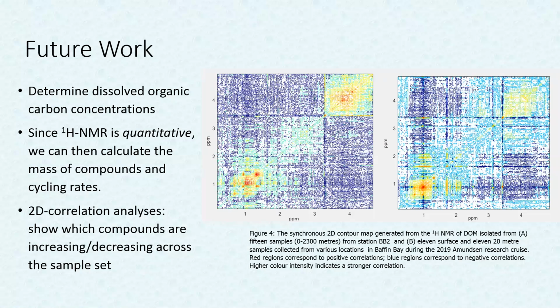Moving forward, I plan to calculate the DOC concentrations as well as use 2D correlation analysis to further analyze the changes in DOM abundance throughout Baffin Bay.